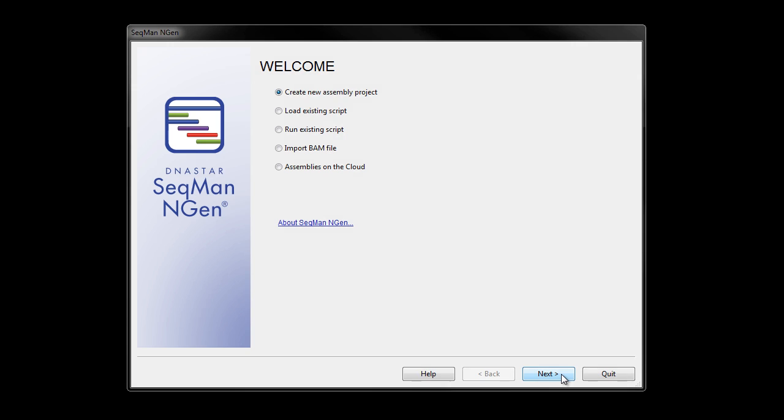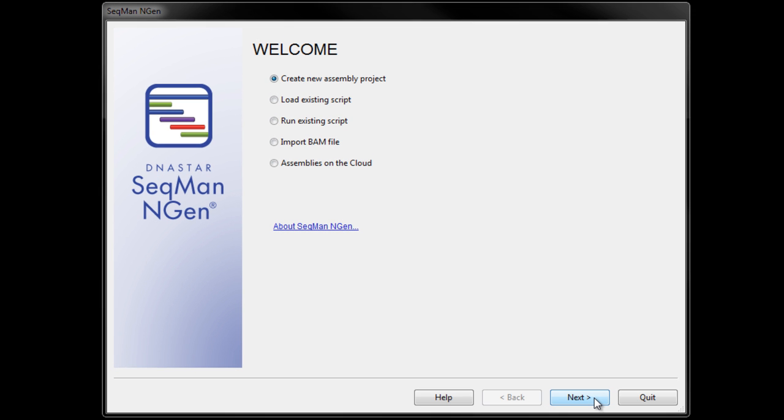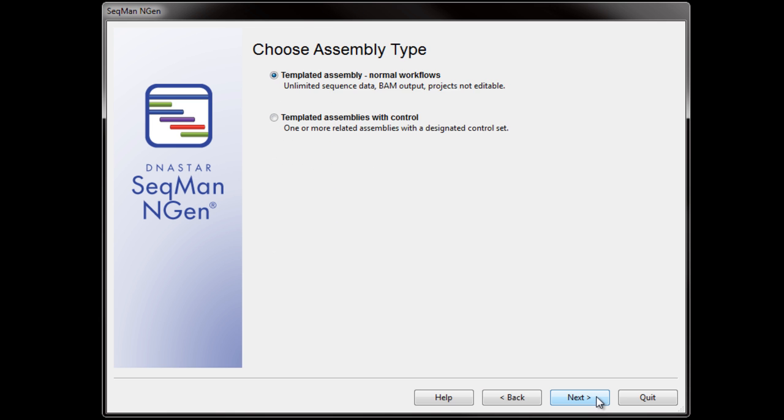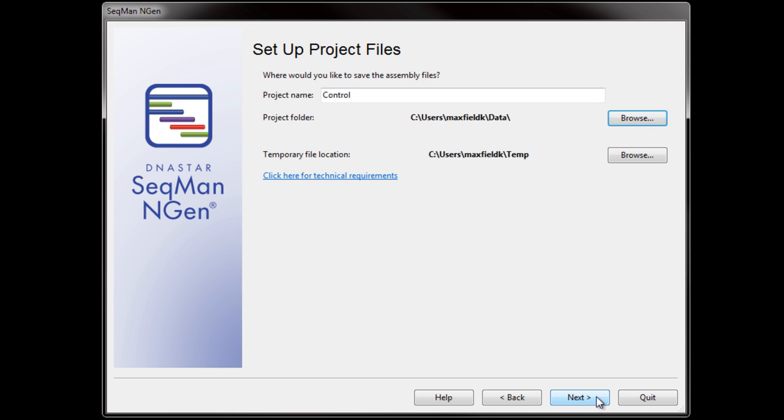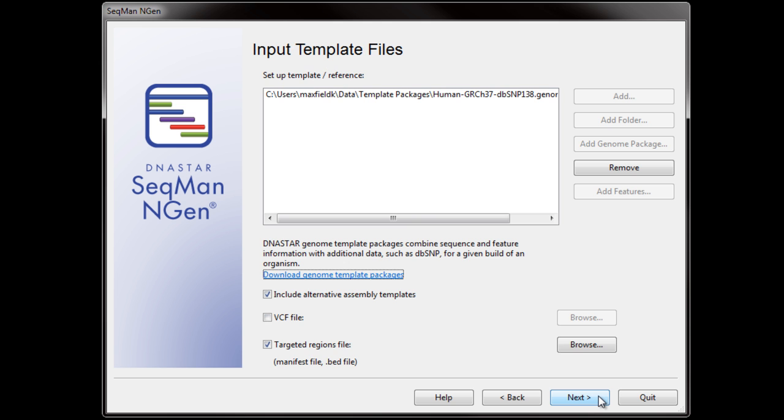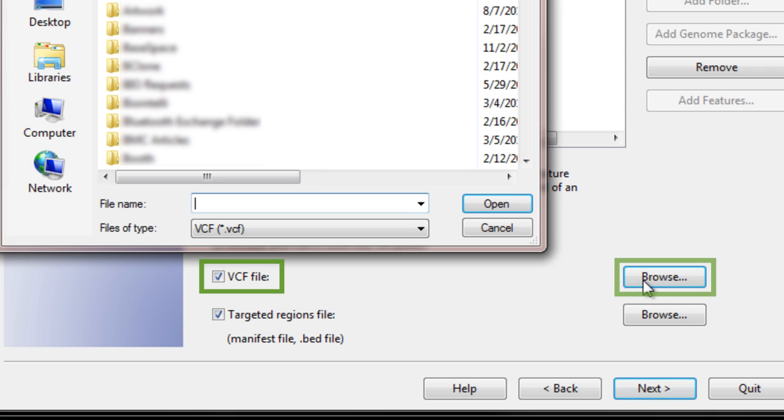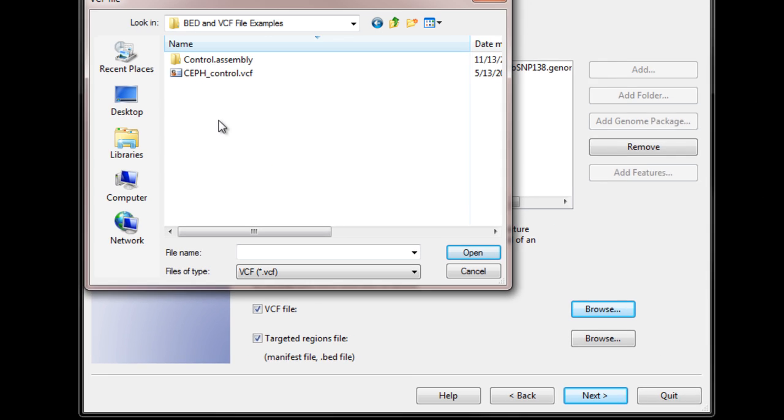To use a VCF file for SNP analysis, we need to load it in during assembly setup in SeekMan NGen. VCF files can be used for a variety of templated project types. When you get to the Input Template Files page, check VCF file, and then click Browse to locate your VCF file.